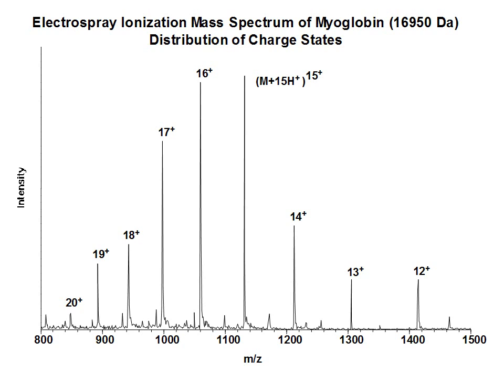Originally, this was considered a big disadvantage of electrospray ionization mass spectrometry because it leads to very complicated mass spectra. Imagine, if one molecule already gives 10 peaks, what would happen if you had 1,000 molecules in a sample? It would not be possible anymore to discern which peak belongs to which molecule. However, fortunately, we have liquid chromatography to separate molecules, and fortunately, not every molecule acquires as many charges as myoglobin.